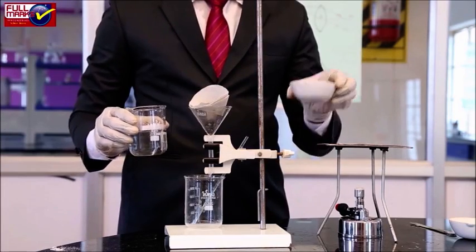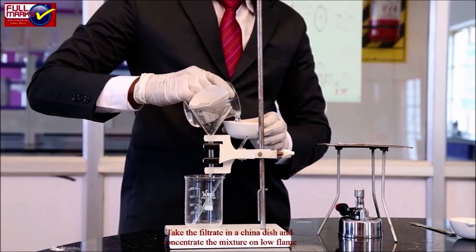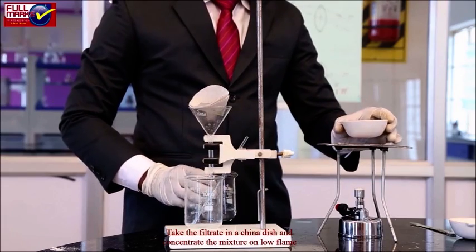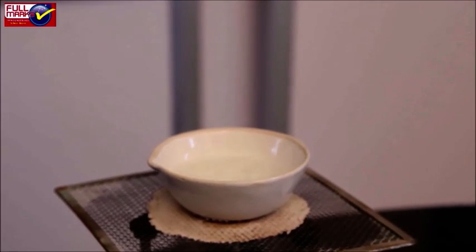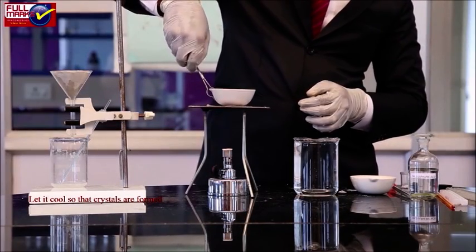Concentration of filtrate and cooling of solution: Take the filtrate in a china dish and concentrate the mixture on a low flame. Once you get to the crystallization point, stop heating. Let it cool so that crystals are formed.